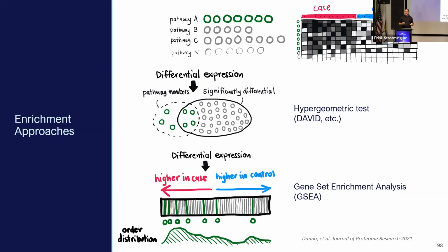And then what the algorithm does is it basically says, now give me a database of pathways. And this is something like KEGG, right? And it steps through every single pathway and it does these tests. And then you'll get metrics out, you'll get a p-value and some kind of fold enrichment for every single pathway.